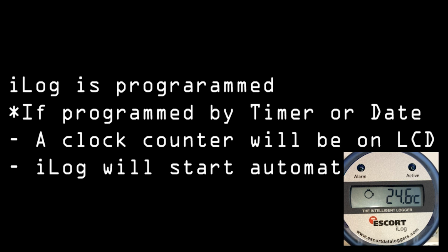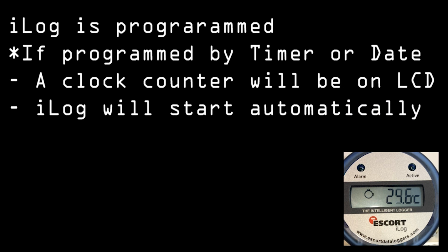If you programmed the unit with a time-delayed start you will see the countdown timer and then it will start recording temperatures.